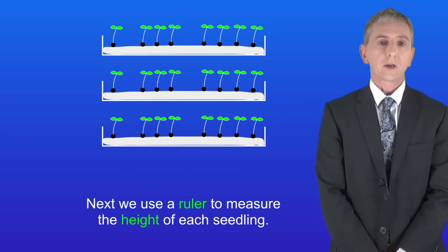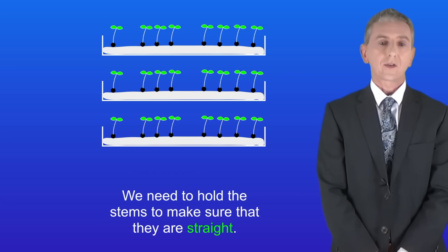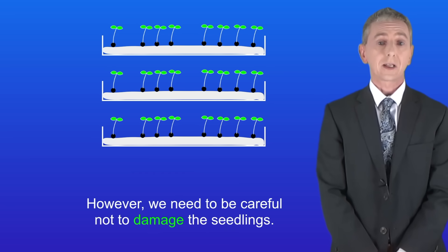Next we use a ruler to measure the height of each seedling. We need to hold the stems to make sure that they're straight. However, we need to be careful not to damage the seedlings.